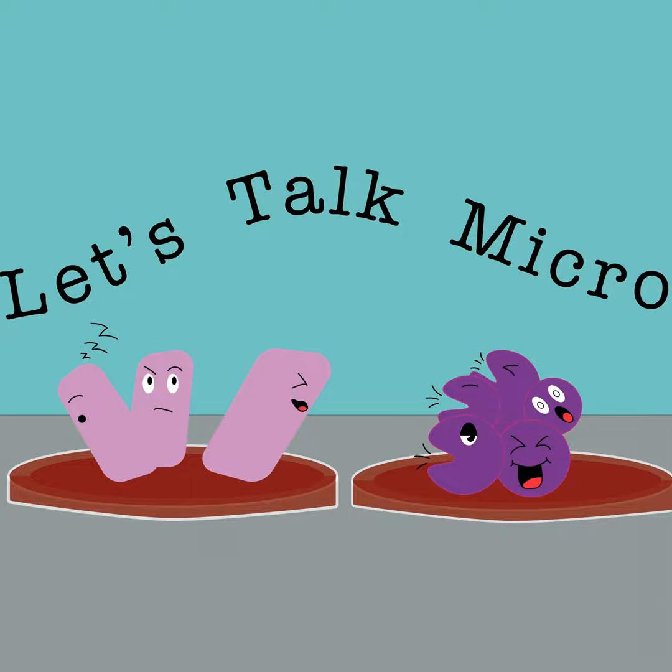And so some of what I sent the students home with were laboratory mock-up kinds of things. But I really wanted them to have a rich, robust experience with microscopy. So in my mind, I really needed to send them home with microscopes, and not just any microscope. I wanted them to have an oil immersion objective lens on their microscope so they could look at bacteria and have a good experience. And I wanted to create an environment where they would be doing what they would be doing in the laboratory, learning how to focus and learning how to distinguish between the microbes.